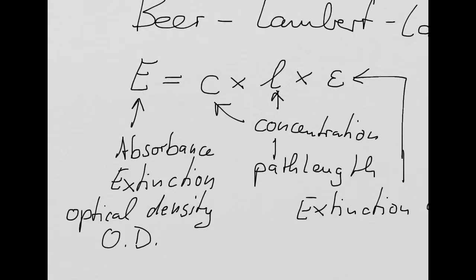Calculate the concentration. A lot of even final year students say, oh yeah, I remember that Klapper who told us the Beer-Lambert law. So I just multiply the wavelength, 420 nanometers, by God knows what. And I go, oh, where did I go wrong?